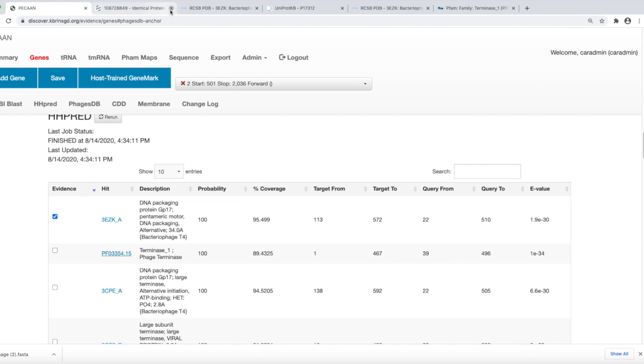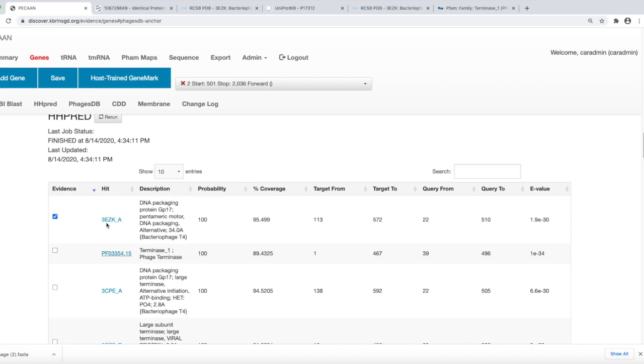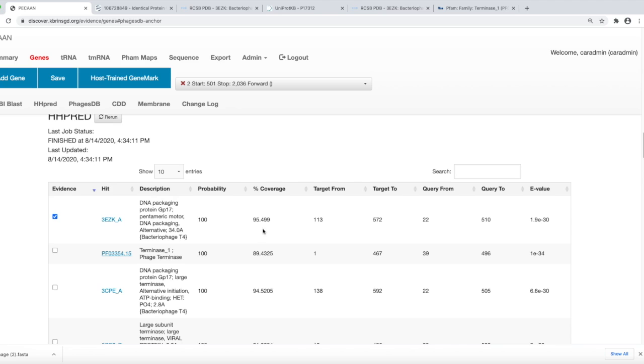If you find hits that have four characters, an underline, and then another character, these are hits to the PDB database. This is a structural database that has three-dimensional structures of proteins. This would be a really good thing to hit. Let's look at, for example, this one that I've already checkmarked.